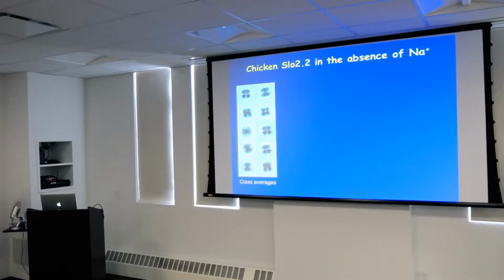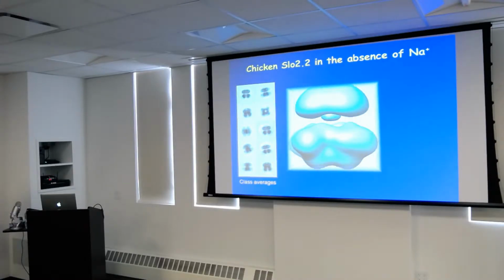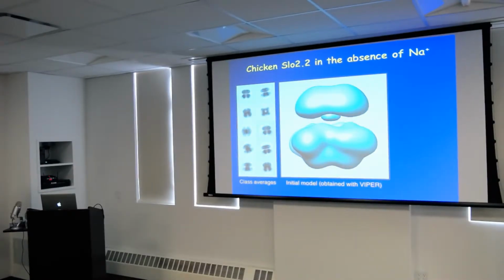And the reason is because now the refinement algorithms can actually correct initial models that are not very good. And how they do that, I will explain in a minute. But basically, you start out with your 2D projections, you get a 3D reconstruction, you have much more fine structure in your 2D maps. And because you're just guessing the initial values, your first initial 3D reconstruction is usually fairly low resolution. But that's all you need. You don't need high resolution at this point, because all you really need is a basic shape of your molecule, so that these orientations are basically defined. And so if this is correct, now you can refine and you can go to higher resolution.